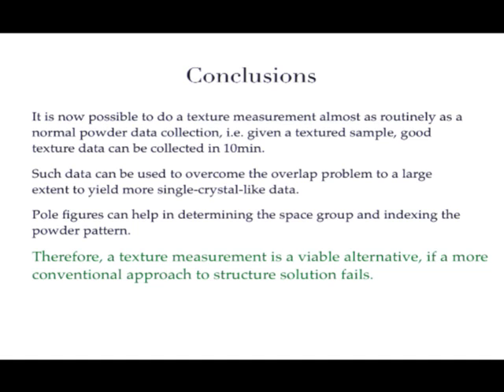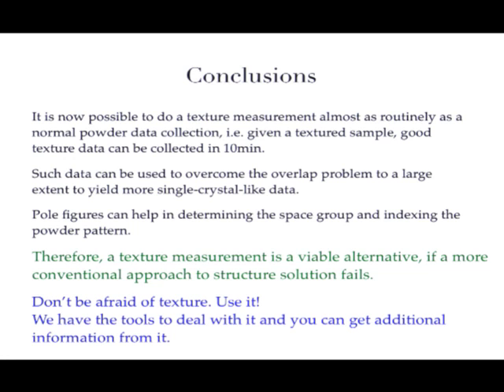Pole figures help to determine the space group and indexing the powder pattern, just what I showed. And therefore, texture measurement is a viable alternative if the more conventional approach to structure solution fails. And something Bob already mentioned, don't be afraid of texture, use it. You have tools to deal with it, and you can get additional information from it. Thank you for your attention.